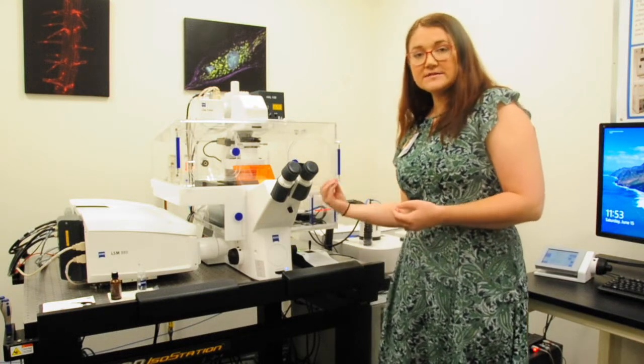It is then collected through the objective, comes back through here, and we have our PMTs in here. This particular variety has two PMTs and a 32 GaAsP detector array.